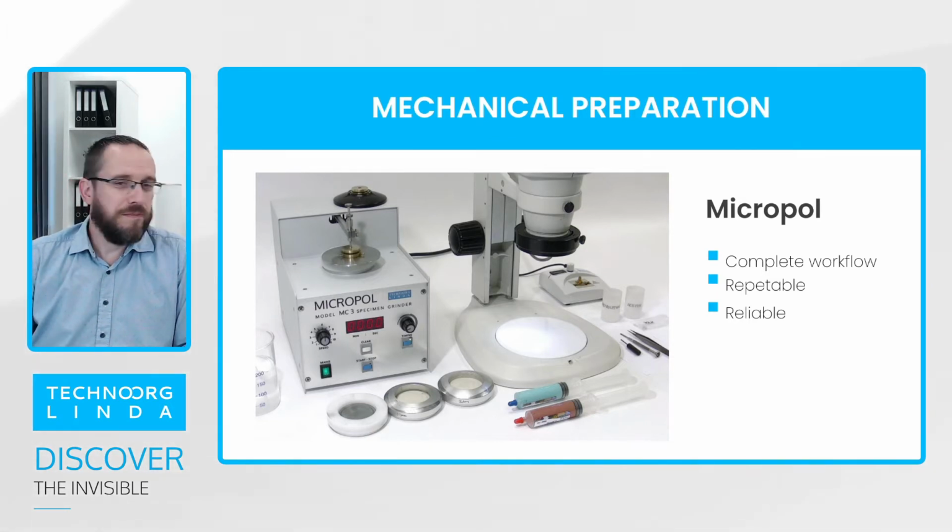Another very important point here, just to make it clear. You can find countless saws and polisher machines on the market. Really a big amount of them, but we are talking about very, very small samples.